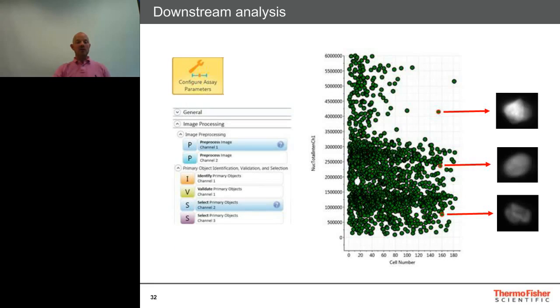We can actually visualize all of the cells. Here we have cells labeled with DAPI, showing characteristic cell cycle distributions of DNA dye. We can see the 2N population, the 4N population, and the super-4N population, borne out visually — cells with greater DNA dye concentrations have synthesized DNA prior to mitosis, while those with far more are not really part of the normal cell cycle. We can do this for any number of different reporters in any channels, and can visualize cells to do a sort of pre-acquisition QC to make sure we're seeing what we should be seeing.